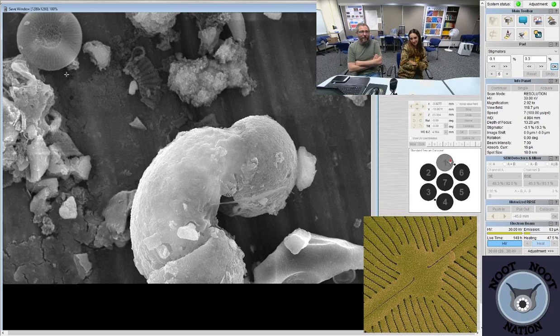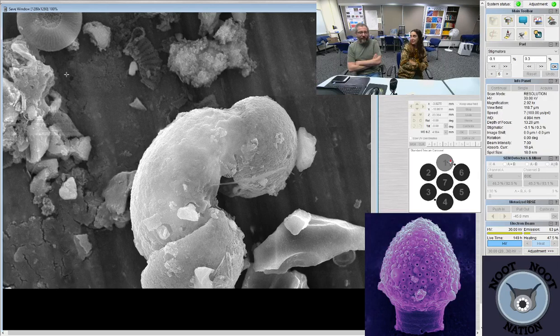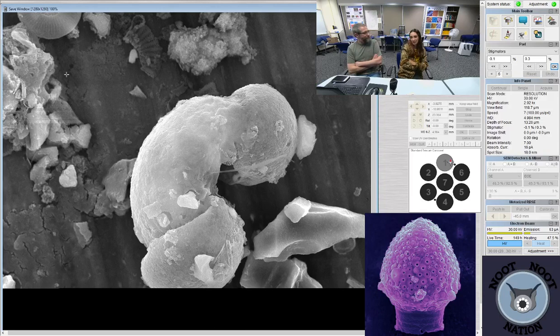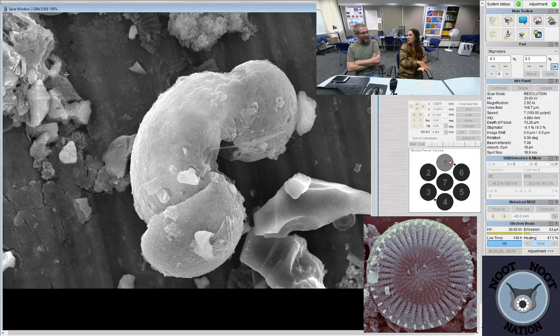I didn't want to work with them because, in part, the processing requires that you use HF. And yes, I don't want to work with chemicals that might kill me. When we processed pollen at my lab in Colombia, we would be dressed like astronauts. No one could come into the chamber where we were working. And you start and you have to finish, basically, because you have all this gear. And it was pretty scary.